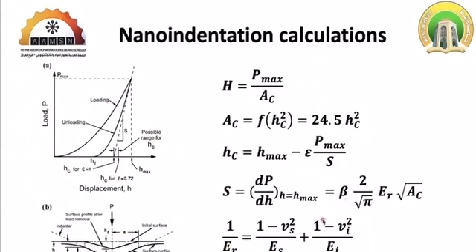Now let's go through some small calculations. This is the load-displacement curve, with the loading segment and the unloading segment.